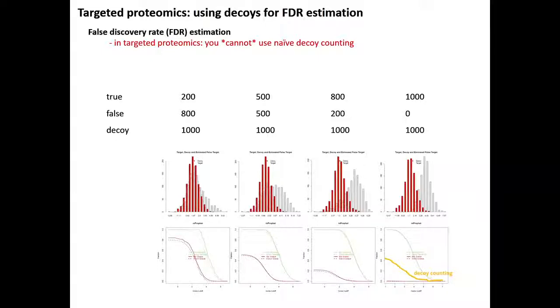So just to see if I've got this right, we're doing a linear combination of subscores, and that takes it to one dimension, and then LDA separates. Yeah, correct. So why are we doing the reduction to one dimension when we could do it in the higher dimension? I don't know. Isa, do you want to comment?